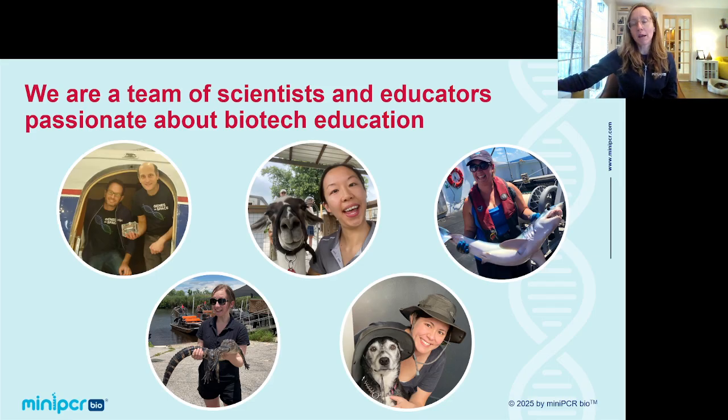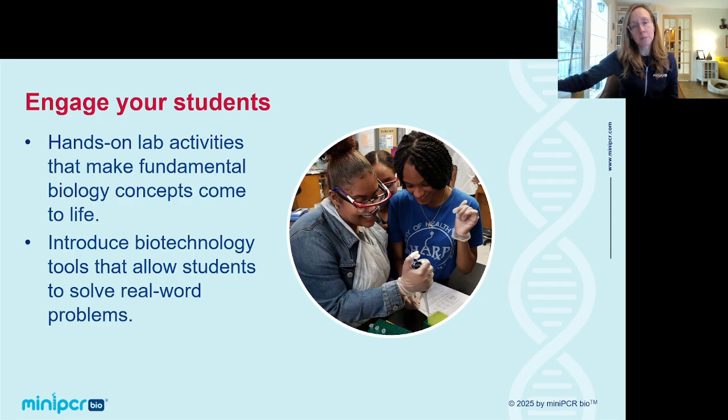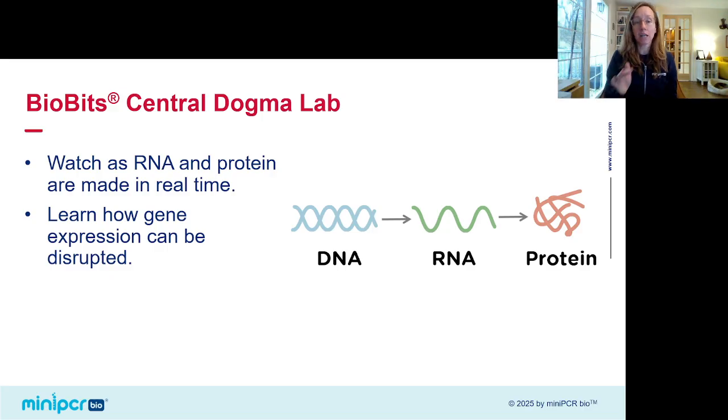The perspective that my colleagues and I bring to writing curriculum is that biotechnology activities, hands-on lab activities, can make fundamental biology concepts come to life and really enliven students. So biotech to us isn't like a 1-week unit that you slot in at the end of the school year after you get through the important stuff. It's actually a lens through which you can cover that important stuff in the first place. And the Central Dogma Lab is a great example of that.